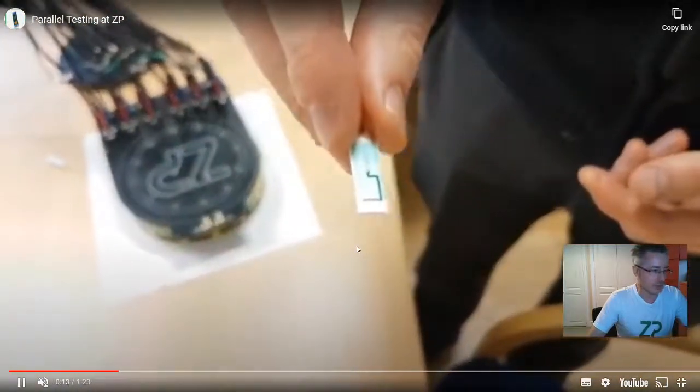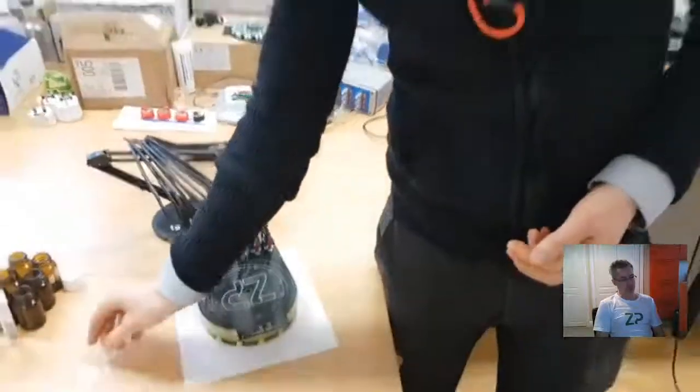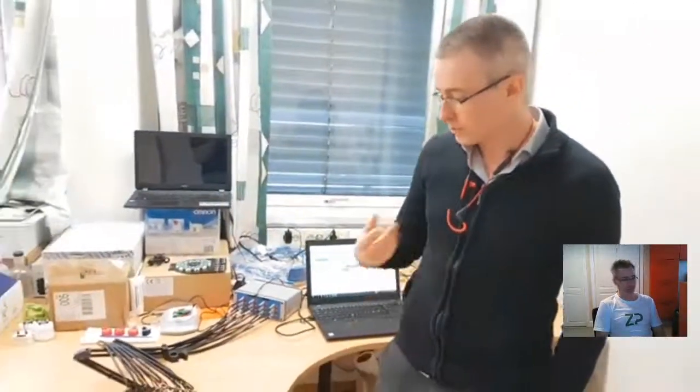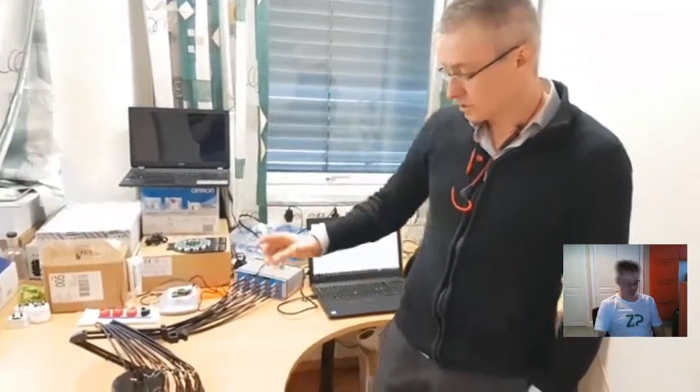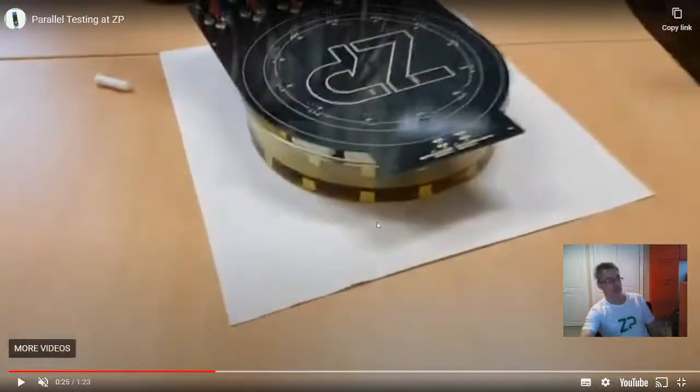Here we're talking about these kinds of electrodes — we call these our value electrodes — and it's probably worth using them because their cost is about half that of normal screen printed electrodes. As the video shows, you can basically see that on this particular jig all the electrodes are pointing downwards into the solution.